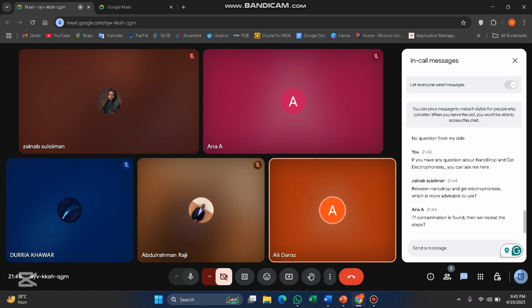Okay, Zainab, you have a question. Between NanoDrop and gel electrophoresis, which is more advisable to use?